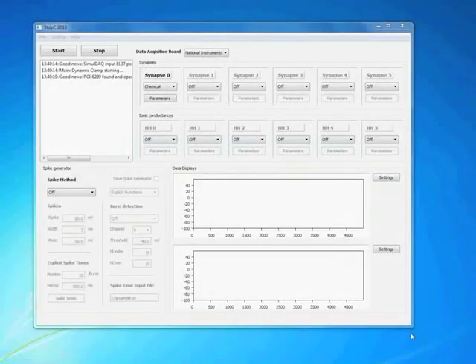In this video I will give a brief introduction into the StdpC software and its configuration. What you see here is the main StdpC window with the elements of menus up here, and we will use them in a second.